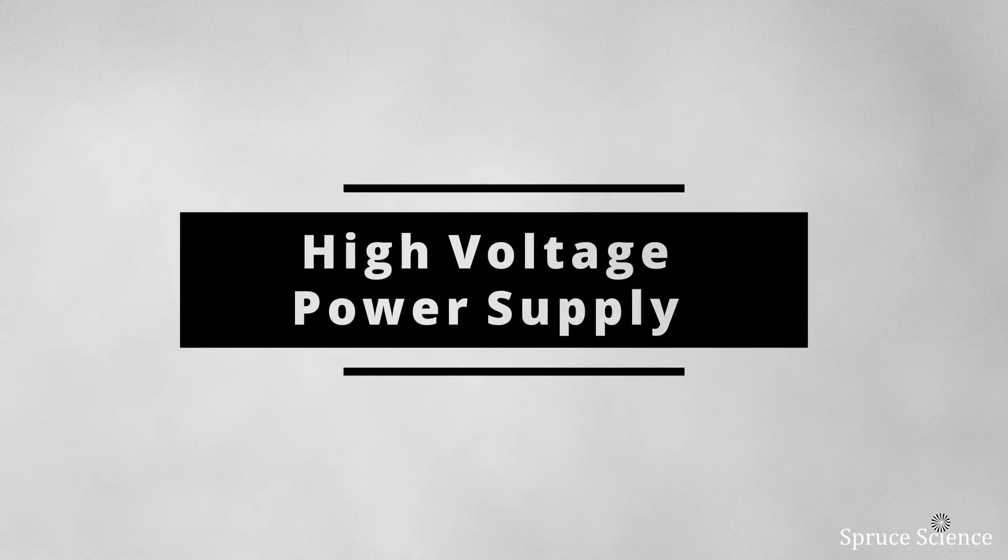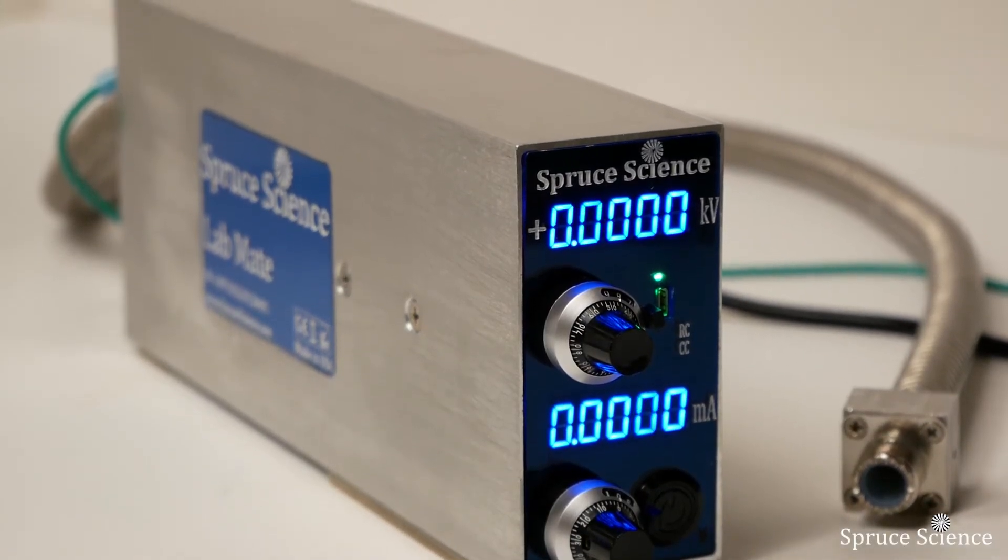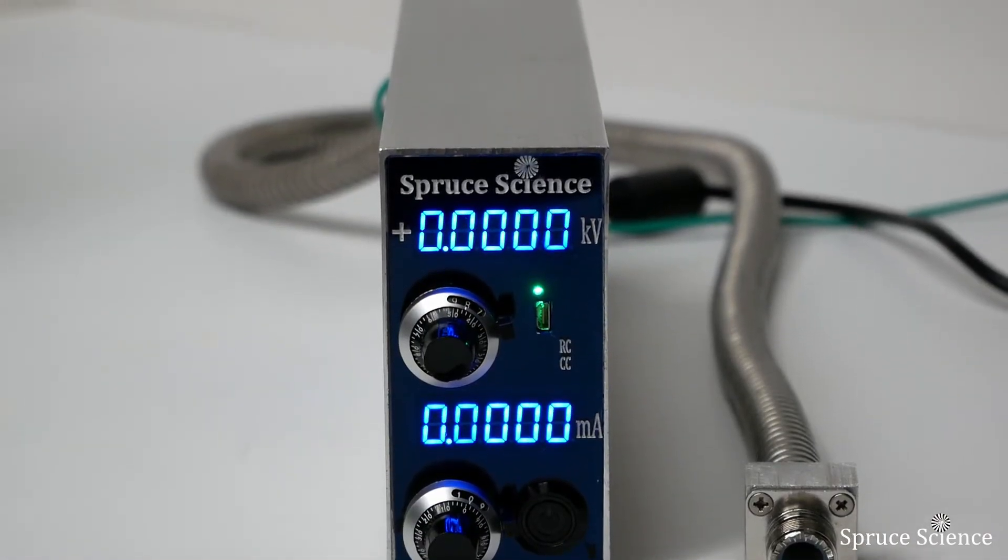Let's now go over the high voltage section. Labmate is an adjustable high voltage switch mode power supply. It is compact, lightweight, and versatile.